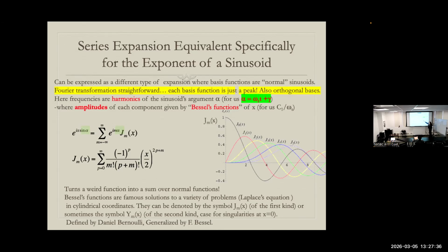You have J1, that's like a first spinning sideband pair. So if there's no amplitude to this oscillation, we only get a center band. If there's amplitude, the first spinning sideband comes in quickly, even with small amplitude. Kind of like sine of it.